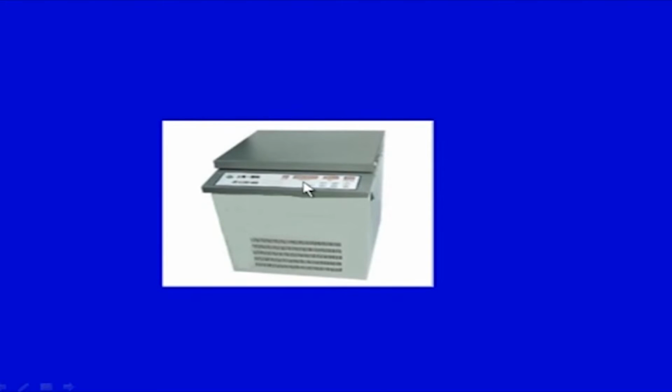And they are used to pellet substances that sediment rapidly, for example RBCs, certain bulky precipitates, yeast cells, nuclei and chloroplasts. A lot of other things could be worked upon here for certain applications. This is a typical high capacity refrigerated centrifuge, as you can see, and it can carry 4 to 6 liters of material. These could vary in capacity, and various types are available in this range.